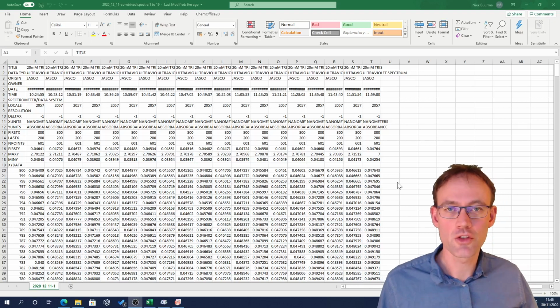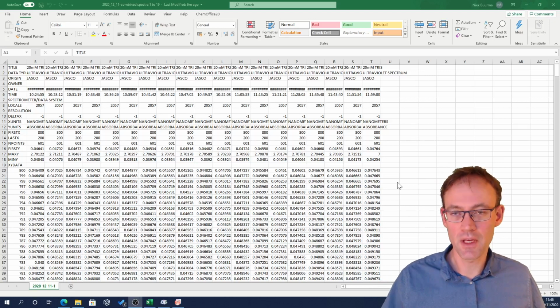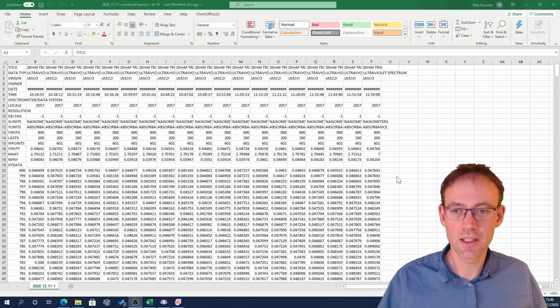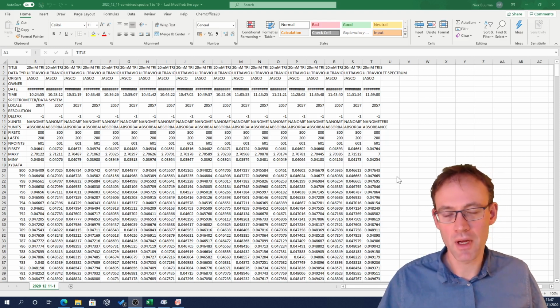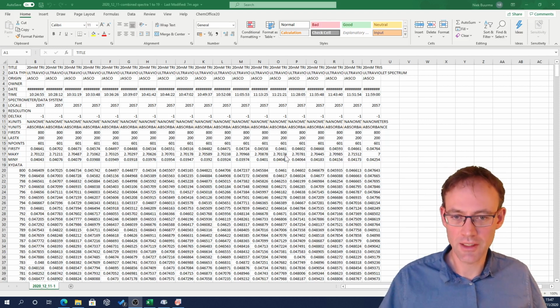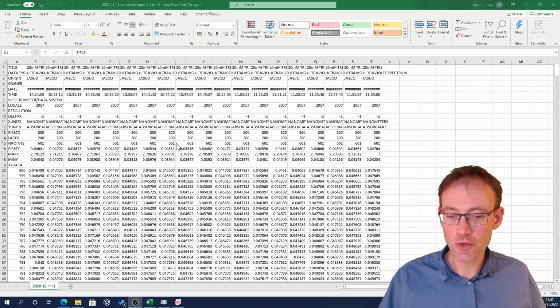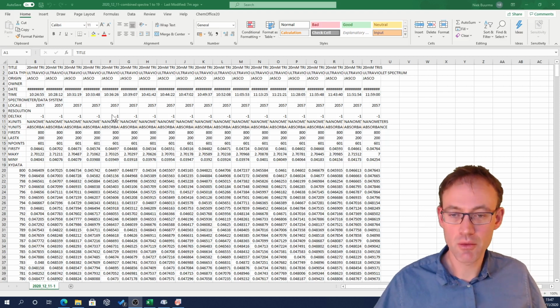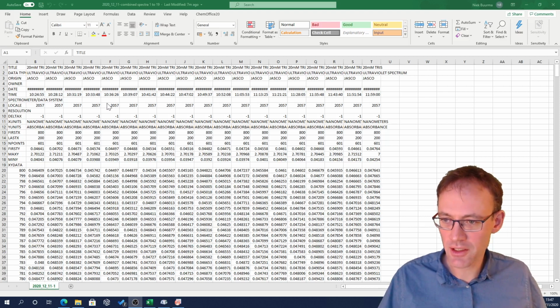So in the previous videos I showed how I can import data saved in text file format into an Excel spreadsheet so that I can then use Excel and other software to analyze and work with the data. Now that I have imported all of those data, I am going to work with them. And the first thing that I probably want to do, given this data set, is clean up this Excel sheet a little bit.